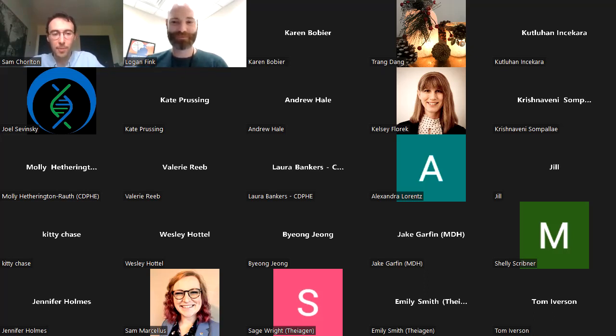So we actually do have an API, and some of our users like CDC are using our API. And the third one is custom integration. Yes, I can post the code afterwards. So we actually integrate with some EMRs right now, for example, LIMS Lite, but we do not currently directly interface with BaseSpace, but that is in the works.